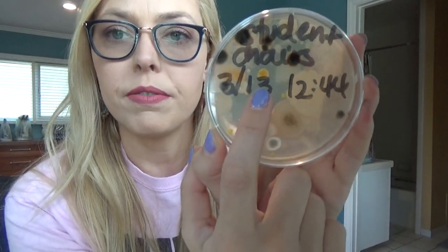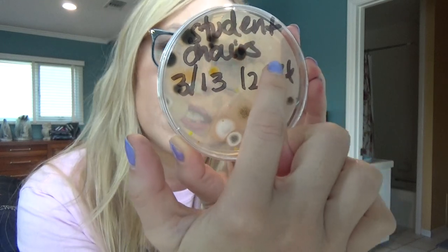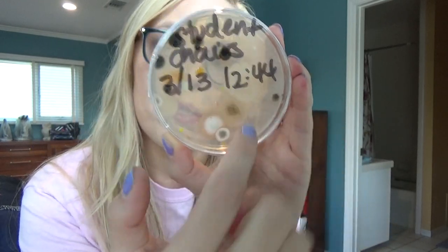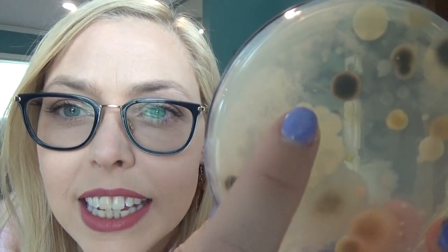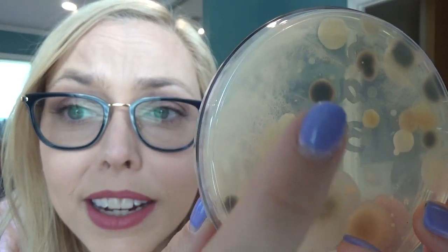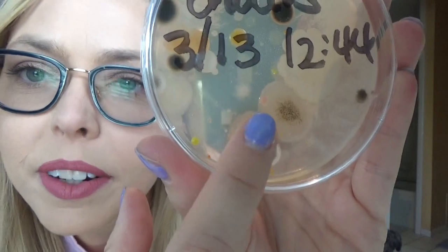These are the chairs — we only did one chair, the first chair in the right front row closest to me if I was standing at the front. We've got a bunch of little spots: a dark spot, a white spot, some orange, and this stuff that just looks like it's growing out like little vines. Lots of achy stuff in there. This stuff actually came out really good — very pretty, even though it's bacteria and it's gross.